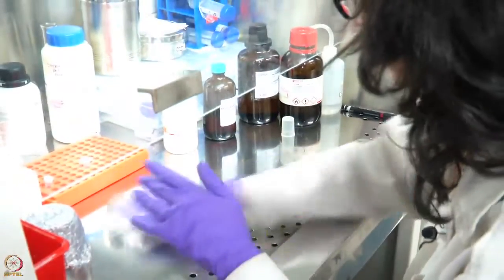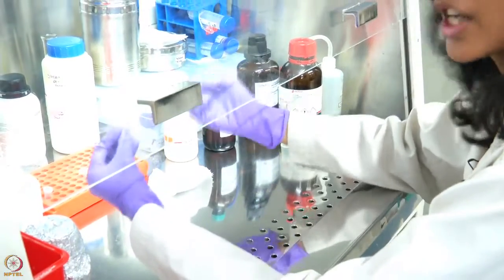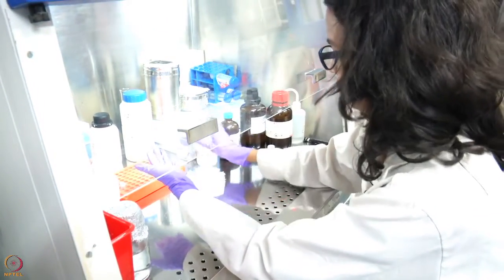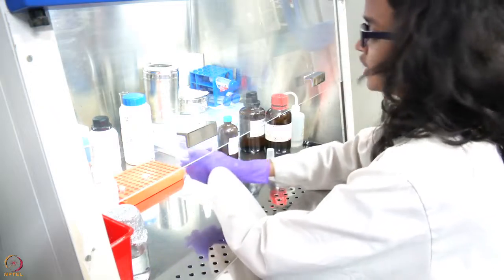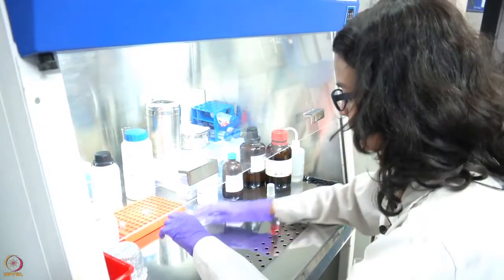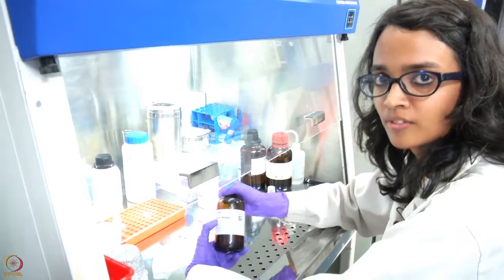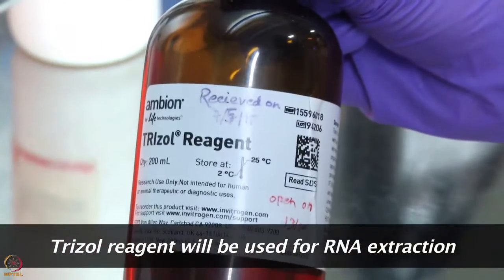We will first clean the surface with RNA-Zap, as well as all surfaces that will be touching any of the tubes or pipettes. The protocol that we will be using today for extracting RNA is the phenol-chloroform protocol, using a commercially available reagent called Trizol.